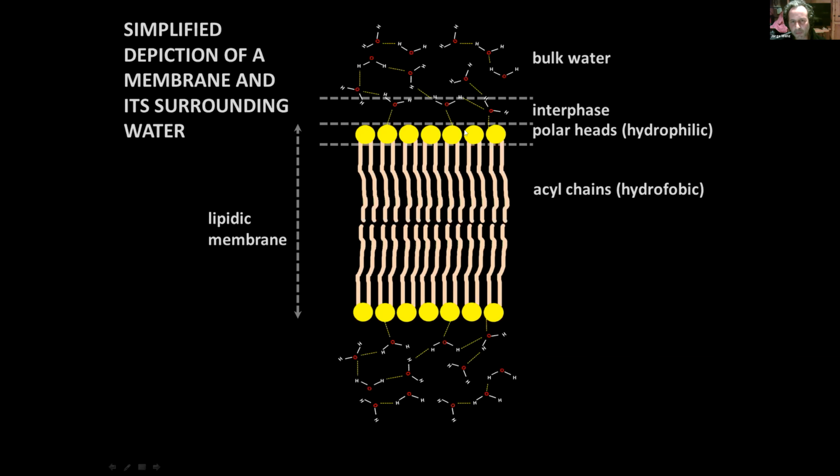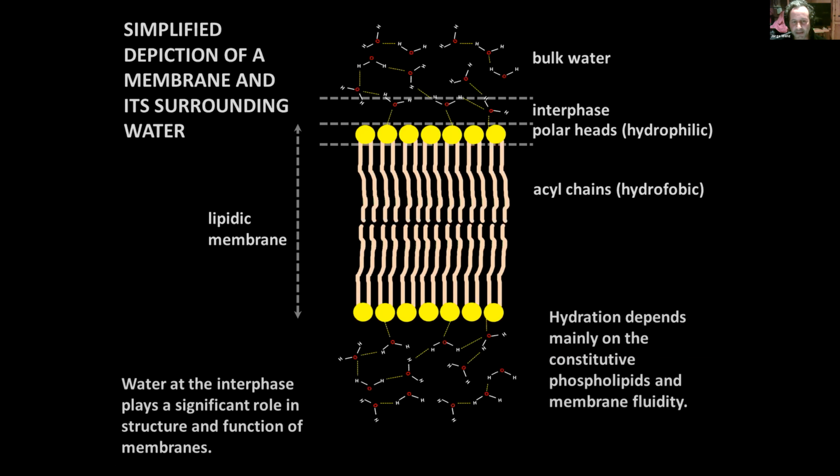For years, I was working with fluorescence spectroscopy, and after reading some papers of Tsenkova, I said to myself, why not start to study membranes with near-infrared spectroscopy and aquaphotomics? Because of that, I jumped off this cliff and started to work on it.